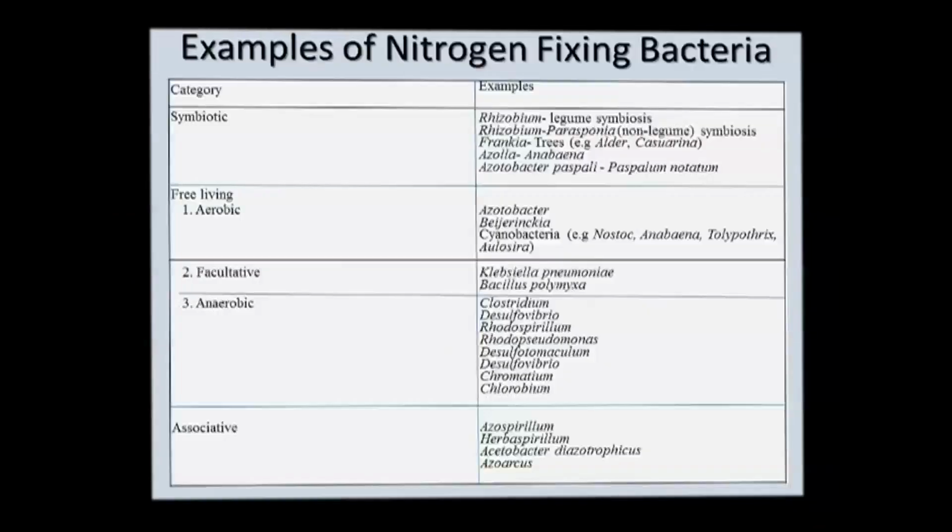But for our protocol experiment, we have chosen the Rhizobium legume symbiosis, the typical bacterium Rhizobium, and we have used the Frankia species. So far, we have seen about Rhizobium. Now, we will briefly see about Frankia.